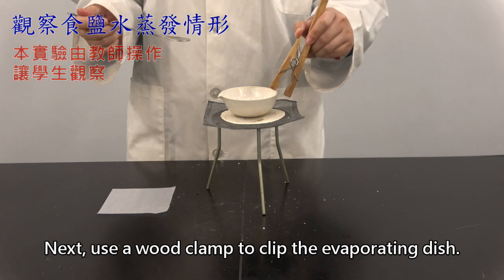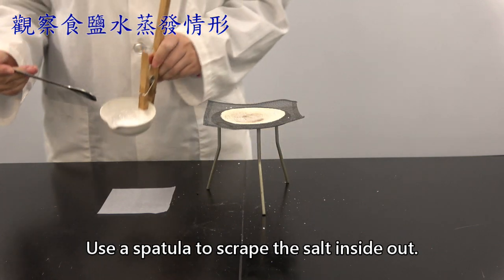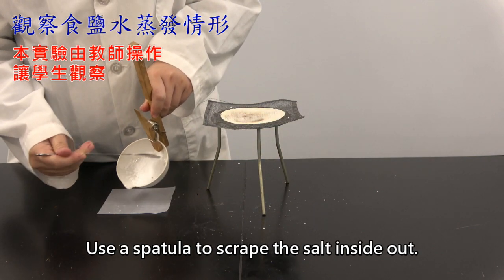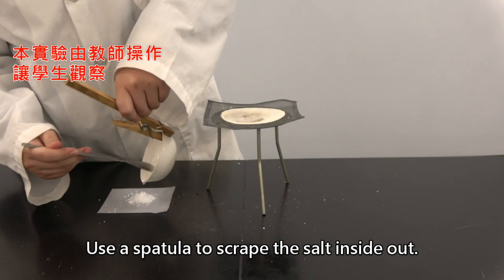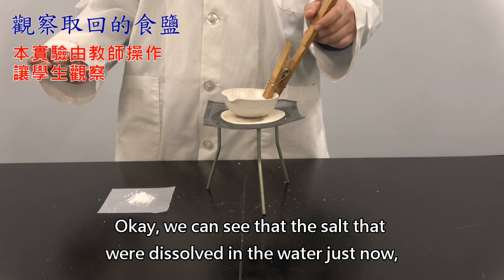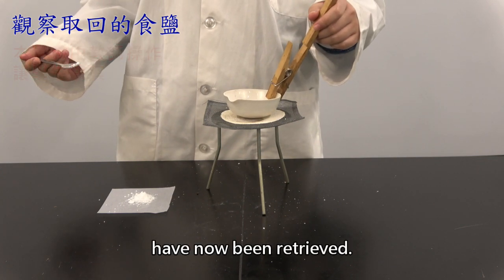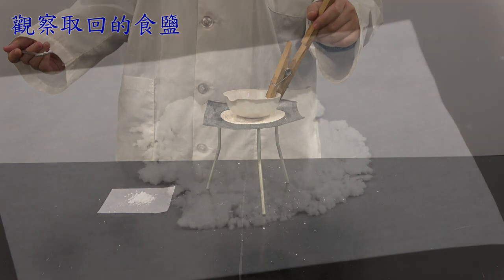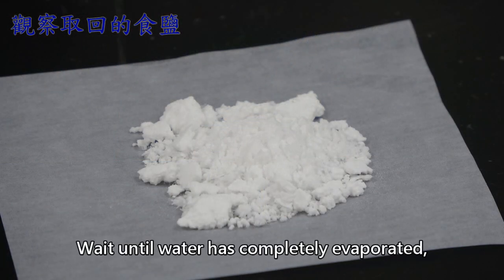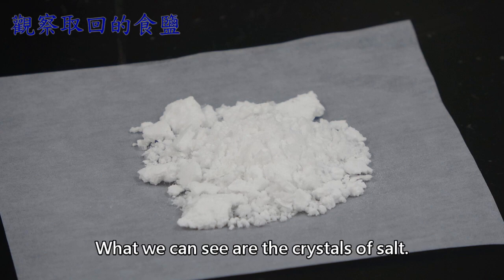Use a wood clamp to clip the evaporating dish. Use a spatula to scrape the salt inside out. We can see that the salt that was dissolved in the water has now been retrieved. Wait until the water has completely evaporated. We can see some white grains — these are the crystals of salt.